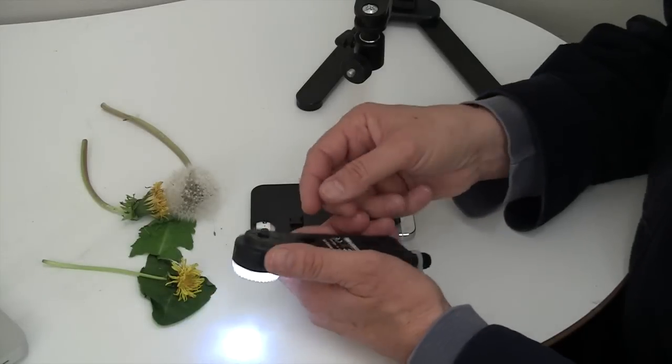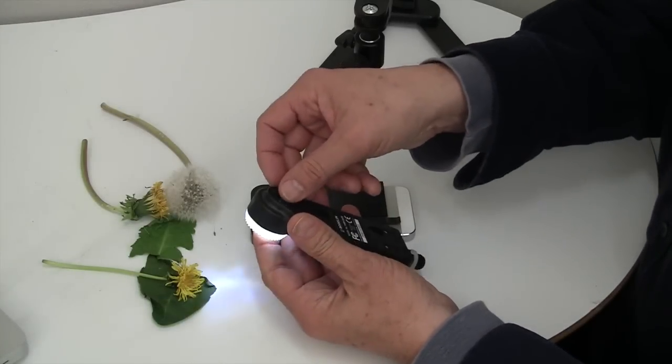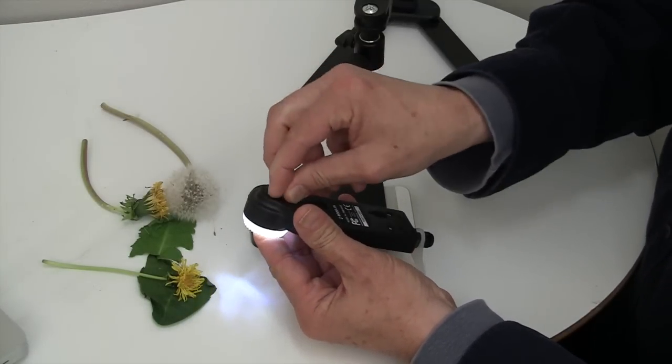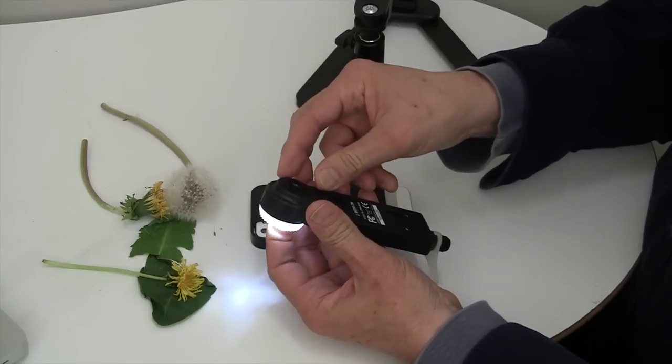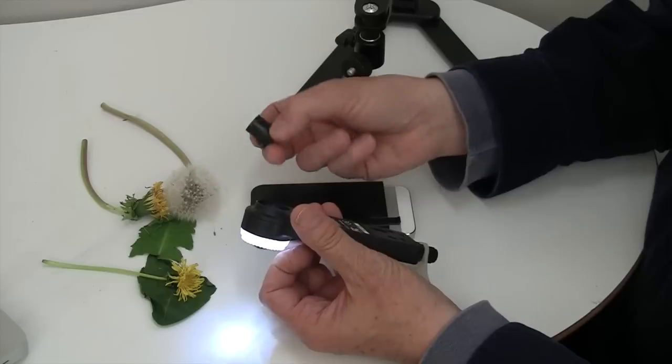But if I want less magnification, all I have to do is remove our lens by turning this counterclockwise, and the lens just pops out.